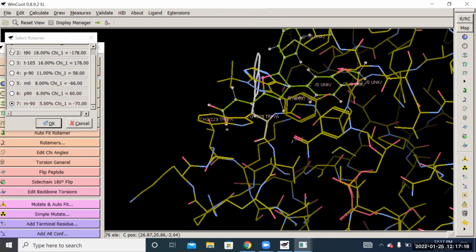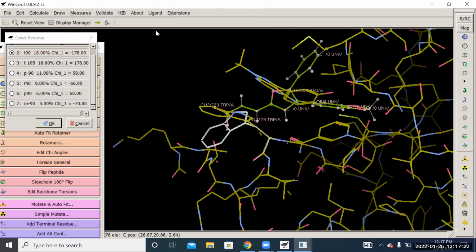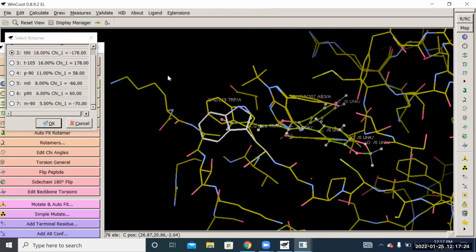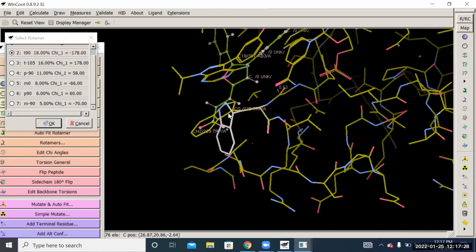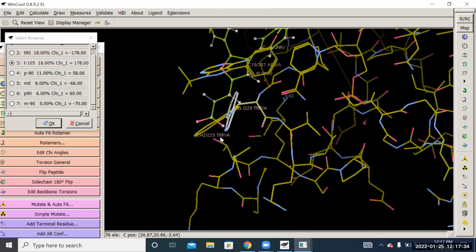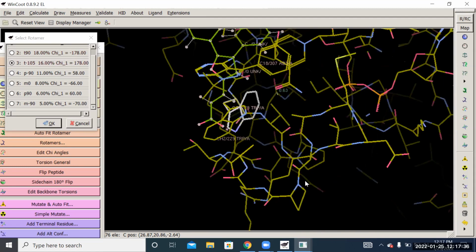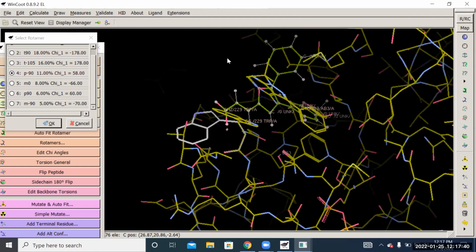So probably, let's see. This one is not great because it's too close over here. But you get the picture: you find the one you like that isn't making bad connections, but that's far enough away.